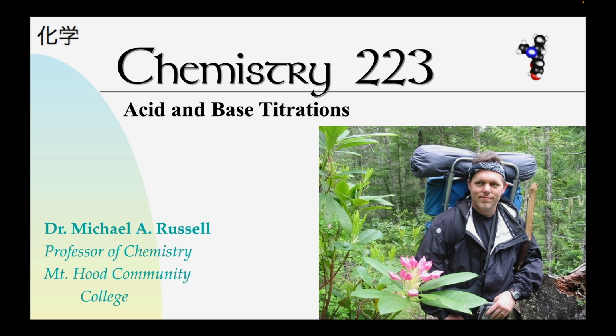It's the first of two labs where we're going to explore in considerable detail how a titration between an acid and base works. In all of these titrations, we will have a base in a burette, and we'll be titrating with an acid which may be known or unknown, and the process is very similar. At the end of this lab, you will have completed three titrations, one involving a strong acid, one a weak acid, and one a polyprotic acid, and they're all kind of cool, as we'll see. So without further ado, let's get into this lab.